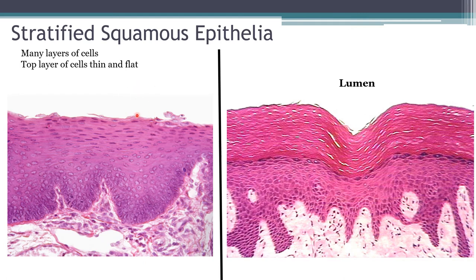Your epithelia is everything from the lumen to this boundary here. Notice that this epithelium is very thick — much thicker than what we saw before. When you look at the cells touching the connective tissue underneath, they won't look thin and flat like the name describes. This name really only describes the cells that are touching the lumen. Notice we've got a cell flaking off here — it's thin and flat, meaning squamous. So the top layers of cells are thin and flat — that's a stratified squamous epithelium.